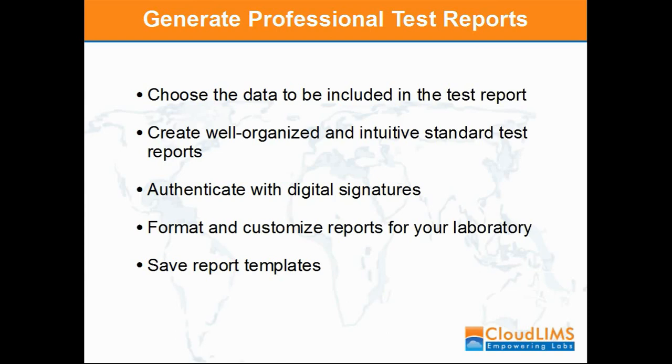The report generation module should be flexible to pull information from various other modules in the LIMS as per the user requirement. For example, the user might just want to include the name of the client in one report and the name and the address in another. The report module should allow the user to save multiple templates that one can use as per the report under question.